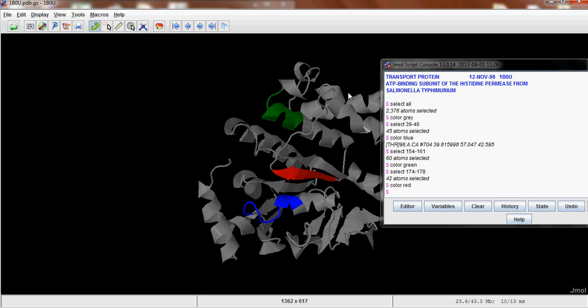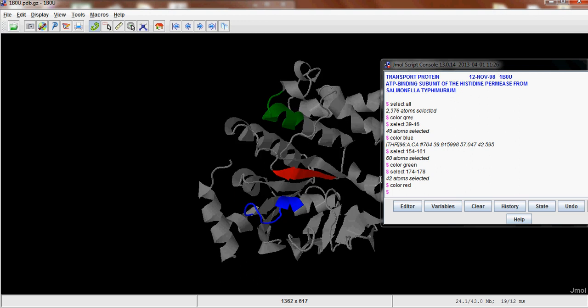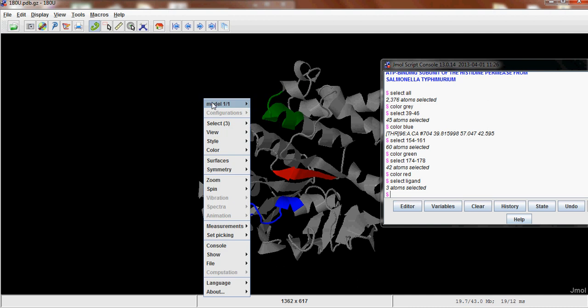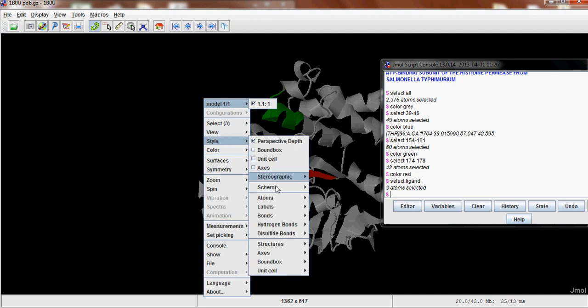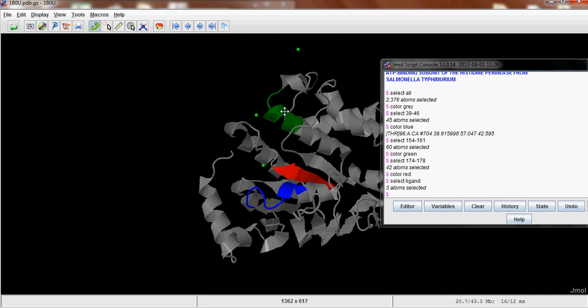The next thing you need to do is show where the ATPs are and how close they are to these domains. So to do that, you can type in Select Ligand. And then right click in the middle here. And go Style, Scheme, Ball and Stick, which will only apply to your ATP.